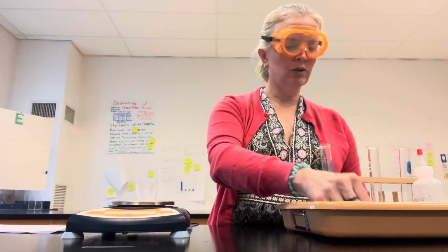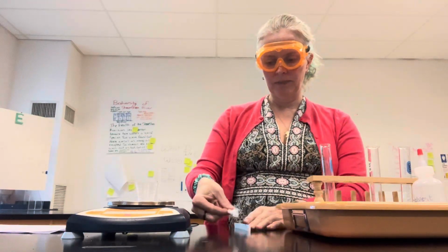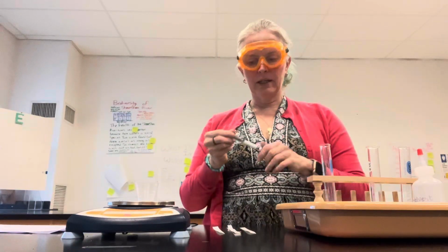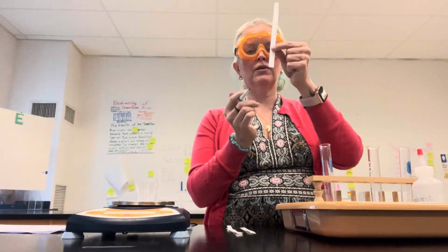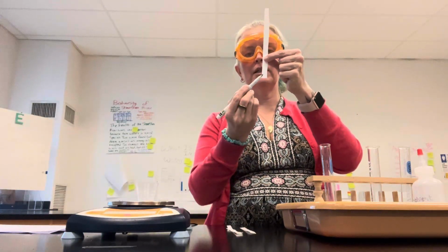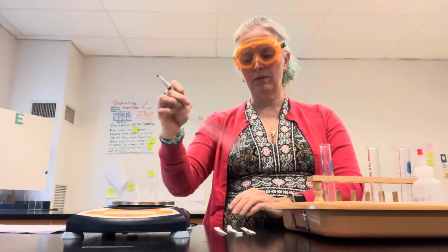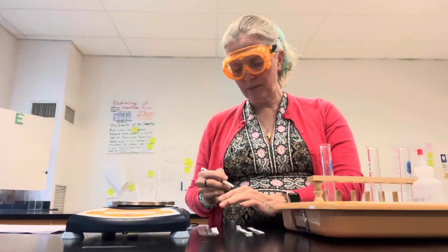You should also see in your tray 3 pieces of filter paper, and this is for testing the 3 pens. So you want to set up the filter paper by marking it. You can either use a dot or a line. You'll see different methods, but try to be consistent. I like to use a dot about 1 centimeter up from the bottom of the paper. So if you have a ruler, you can measure 1 centimeter up and add a dot.